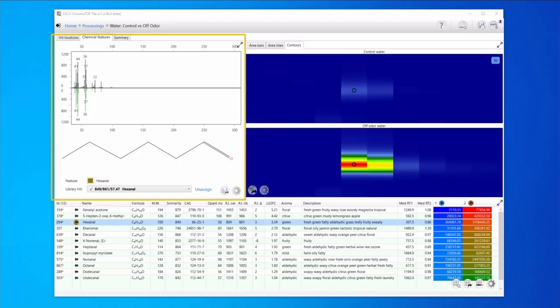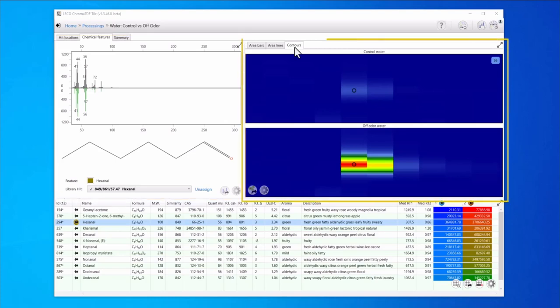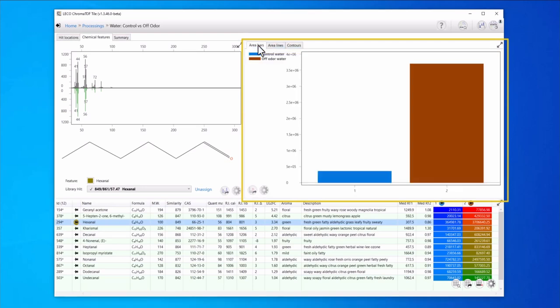In the top left corner, we have the observed spectral information and the library match. In the top right section, we can view the contour plots of the samples and also see the relative trends in the area bars.